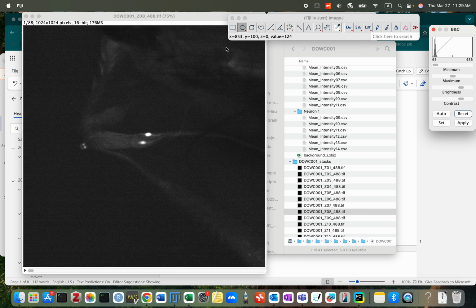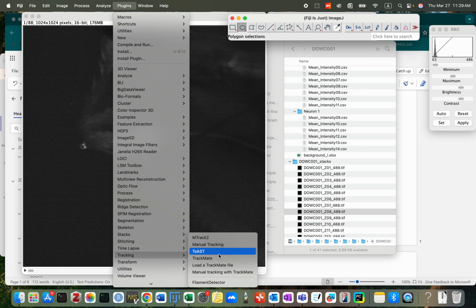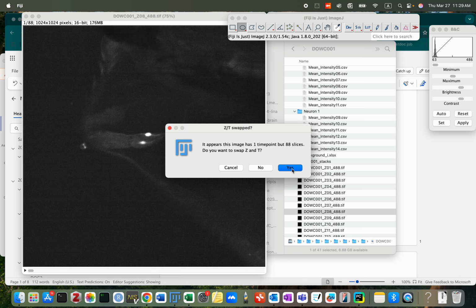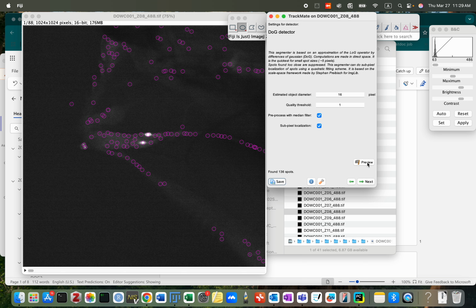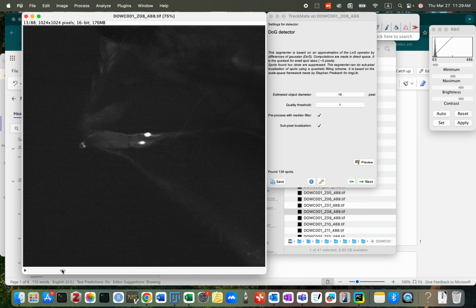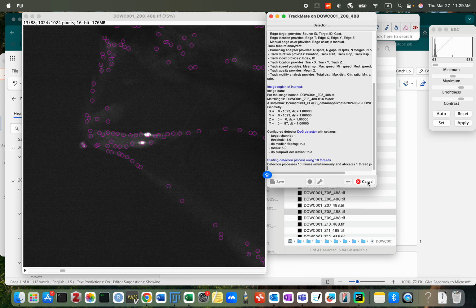Oh, you see? The scanning is away from the center. Yes, the signal is getting weak. Almost done. 16. I want to find the brightest point to see if the 16 works. I think it worked. Okay.